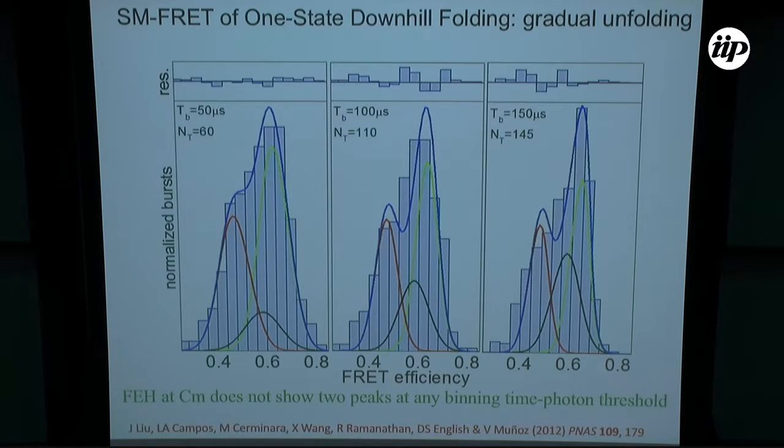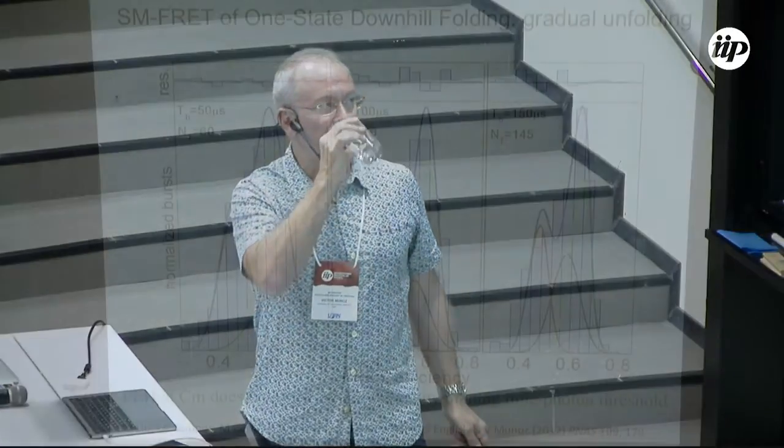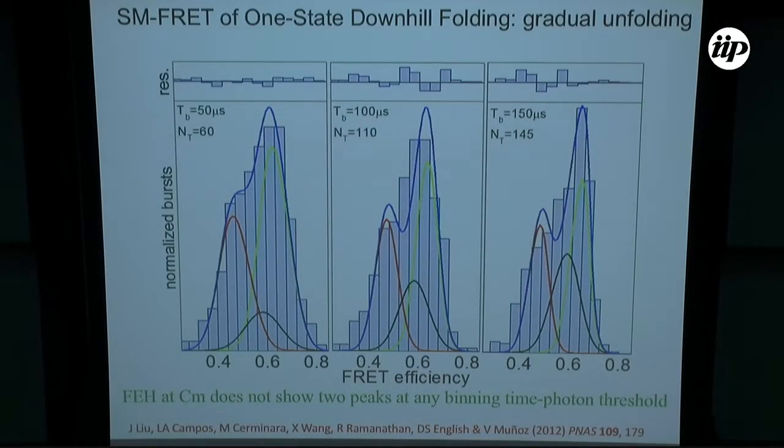And what we did here is something to take into account the possibility of conformational exchange between the two molecules, between the two states. So this is the histogram that you get, I was showing before, at the midpoint. So this is the 6 molar urea one, okay? So those are the bars.